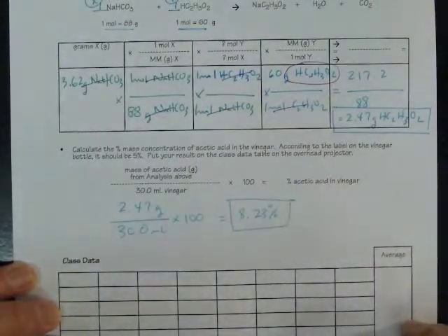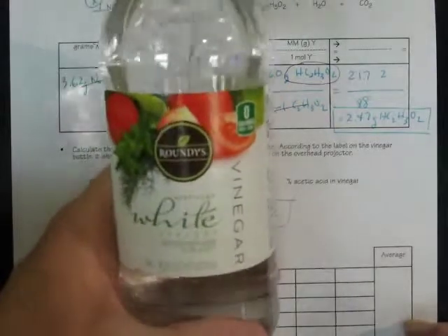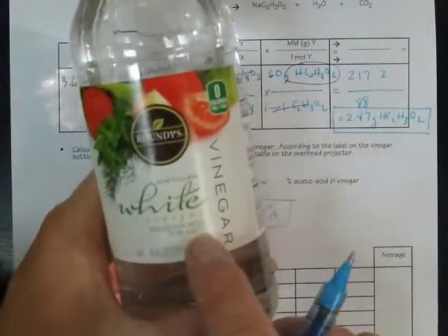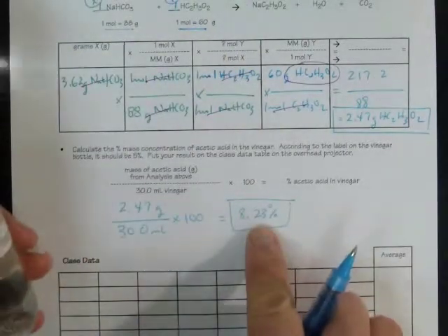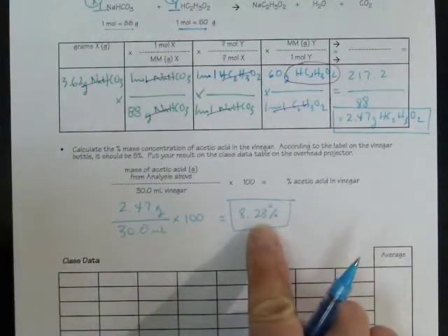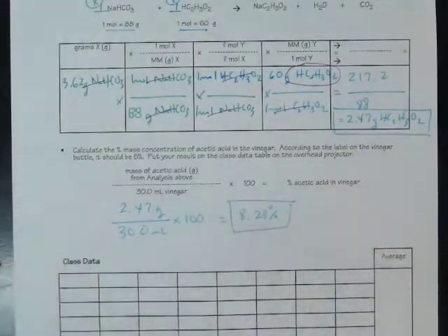That's how much the concentration is according to my findings. However, when you look at the bottle, it says that it's 5% acidity. That there's 5% acid. I found more than 5%. There's a reason why my result came out higher. And it has to do with how we found the end of the acid.